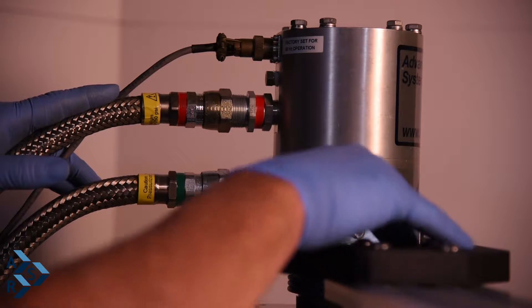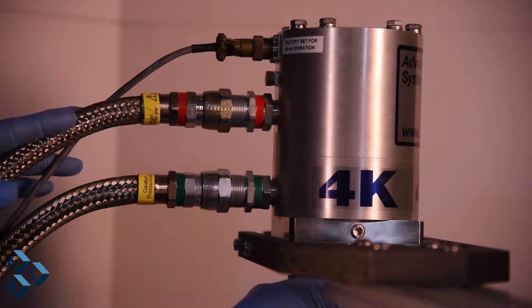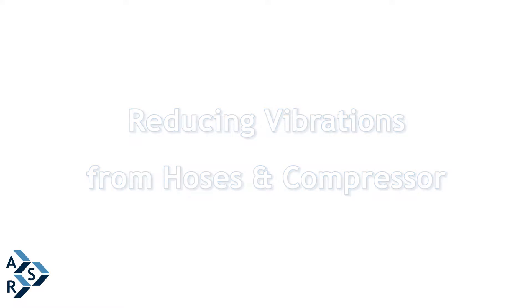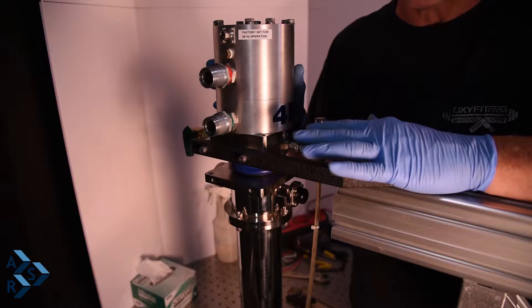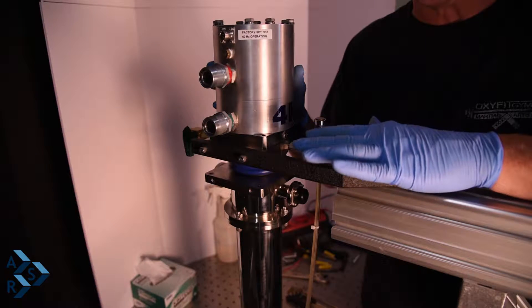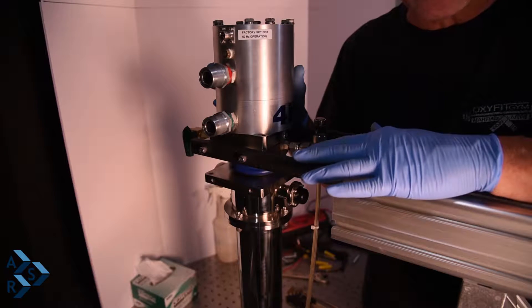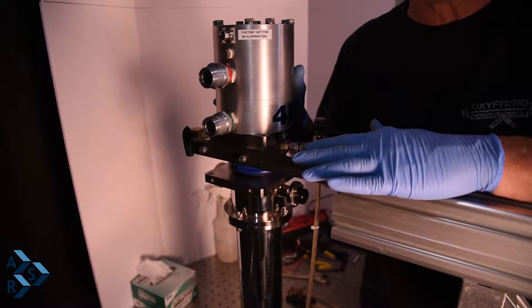We're going to charge and vent the annular space of the cryostat. When hooking up the system, be aware of how far your compressor is from the cryostat — you want it placed in a good spot. The compressor comes on wheels, but you can also put vibration dampeners underneath the wheels to help isolate vibration coming from the compressor. The further away your compressor is from your cryostat, the better.